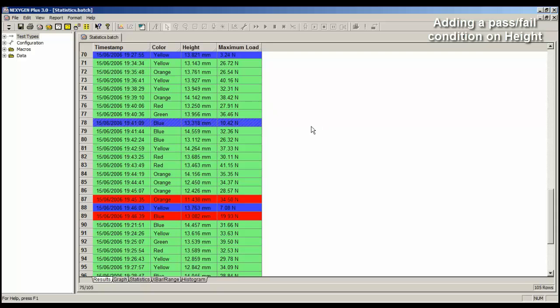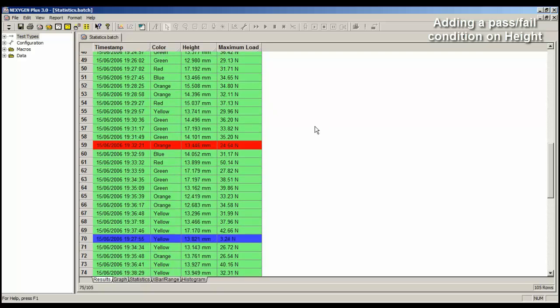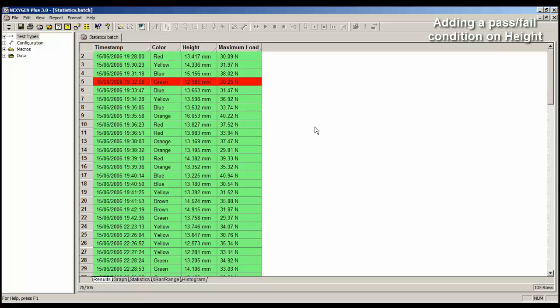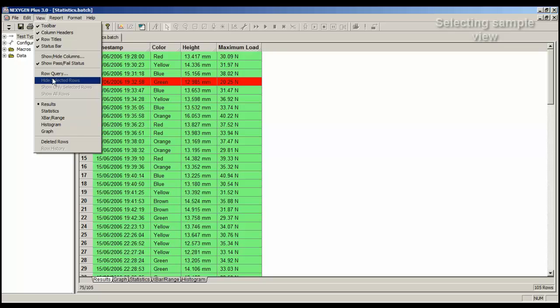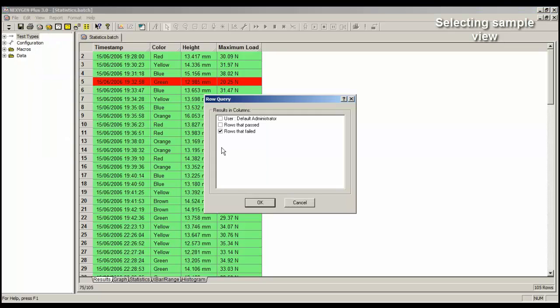Let's examine why each particular test failed. So again, we need to go back to only show the failures. So view, row query, rows that failed, OK.